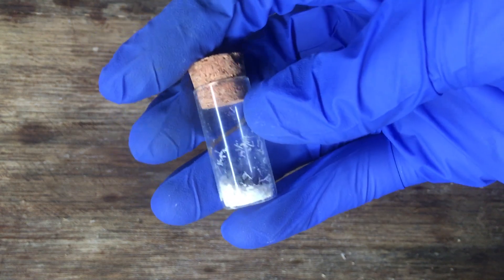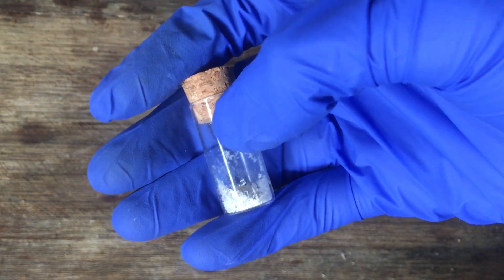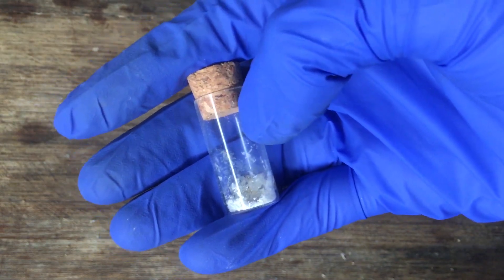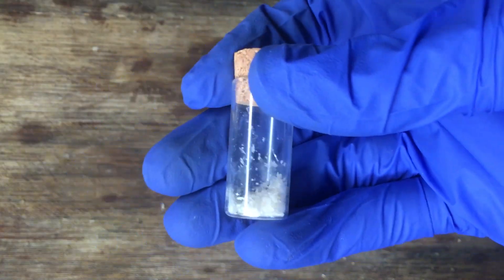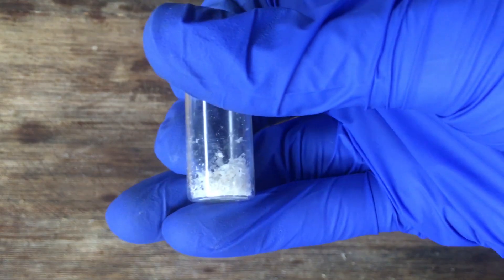You might think that's a bad yield, but it's not absolutely terrible. It represents close to a 20% yield based on how much electricity we passed through the cell. Before we move on, we should definitely test it so that we're not just getting our hopes up.